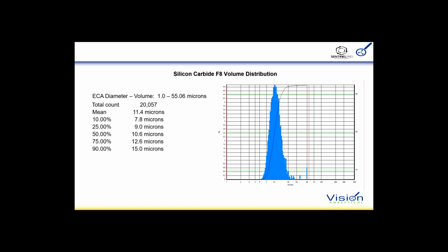Now, one is curious whether we'll be able to get repeat analysis for these three particles, two 50 microns and one 35 micron. We probably should do an additional analysis to see that these particles indeed show up on subsequent analysis.